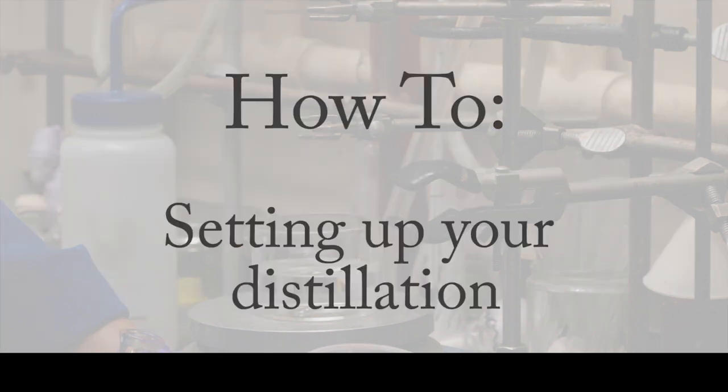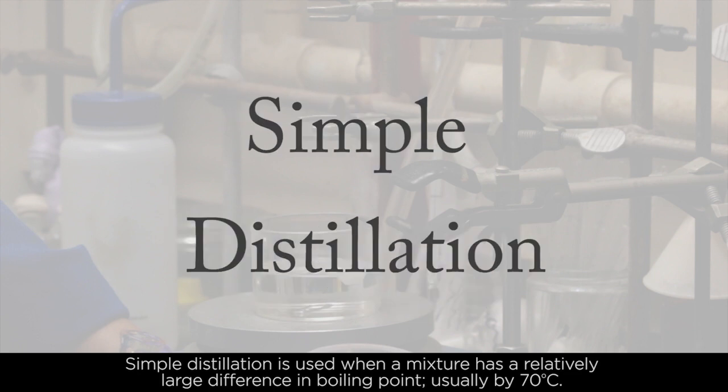How to set up your distillation. Simple distillation is used when a mixture has a relatively large difference in boiling point, usually by 70 degrees Celsius.